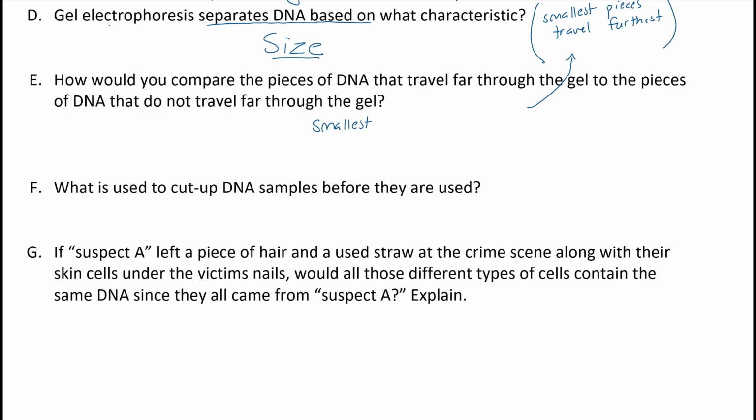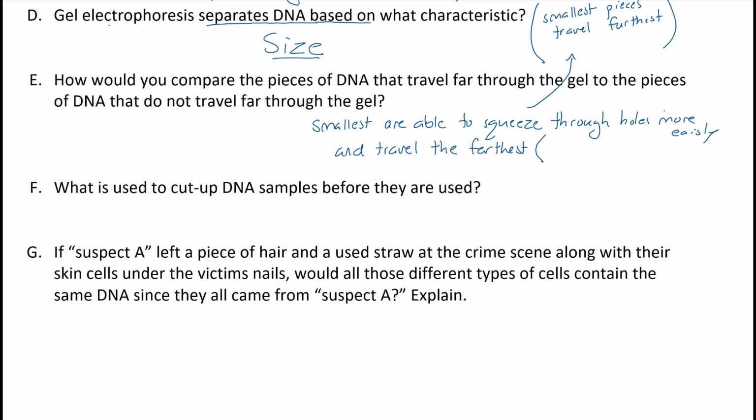This next question, question E, little spoiled. Kind of just said the answer. The smallest pieces are able to snake their way through the holes and go very far. And the largest pieces can't travel that far because they're very big. So they're going to stay very close to the wells.